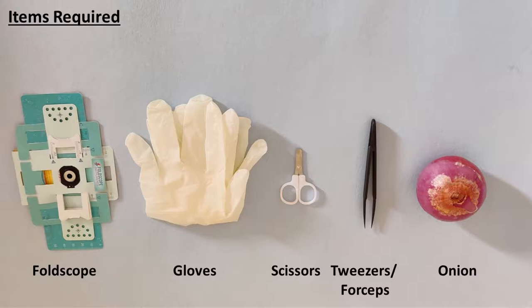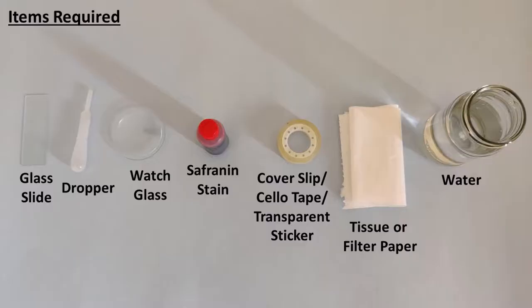For this we will need a foldscope, gloves, scissors, tweezers or forceps, onion, a glass slide, dropper, two watch glasses, saffronin stain, cover slip or cello tape or transparent sticker, tissue or filter paper for blotting excess liquid, and water.